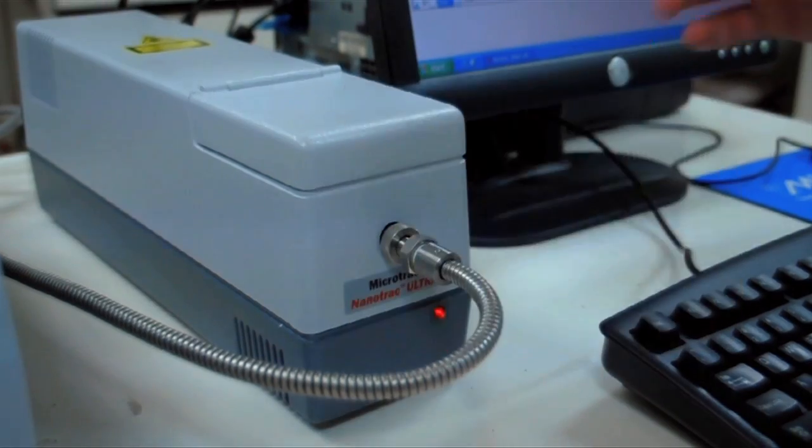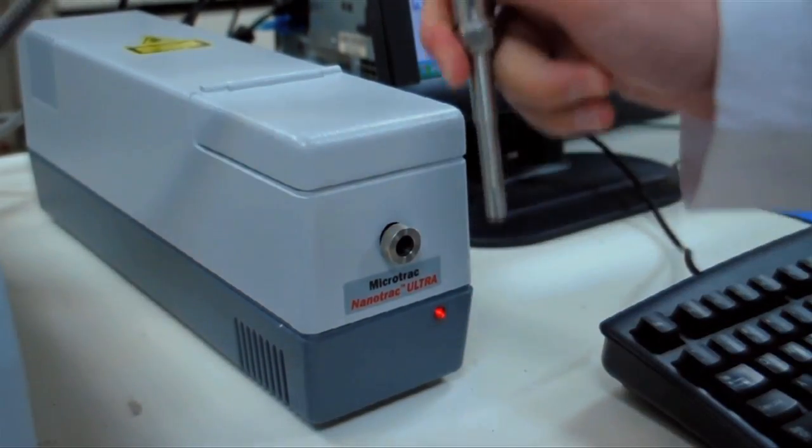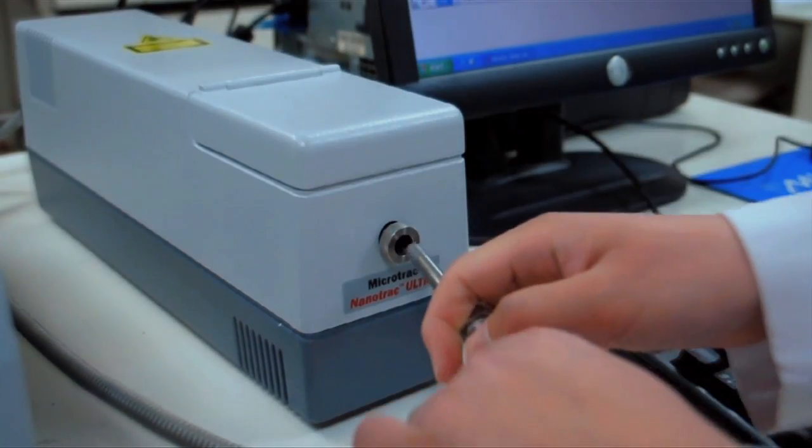A unique feature of the Nanotrack is that it does not require consumables such as cuvettes. It has a handheld probe which can be used to analyze the samples, similar to how you would use a pH probe.